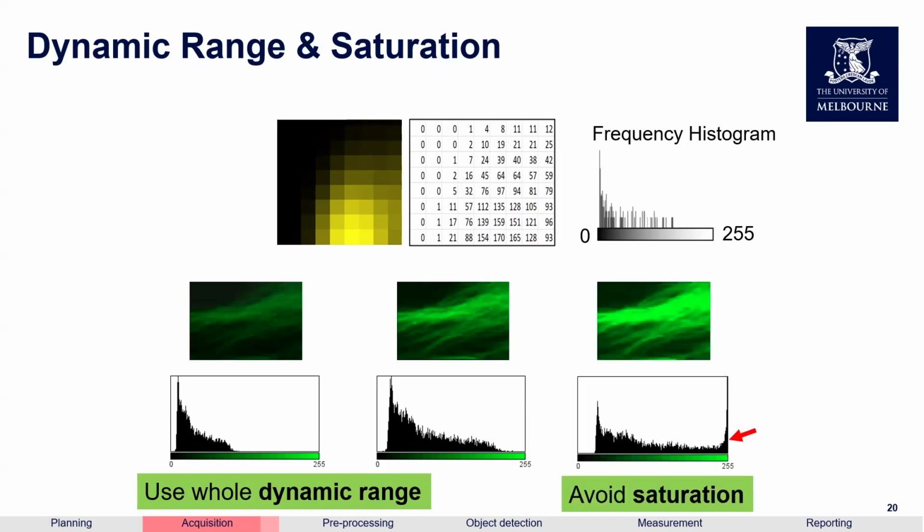On the other hand, if it's too bright, pixels can become saturated, which means that they've reached or exceeded the detector maximum. Once the image is saturated, we can no longer know the true intensity value within those regions, and the quantification becomes invalid. So we always want to check the histogram and use the saturation indicator during acquisition and adjust the settings accordingly.